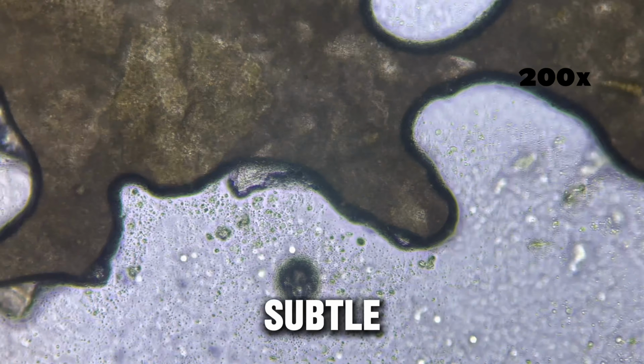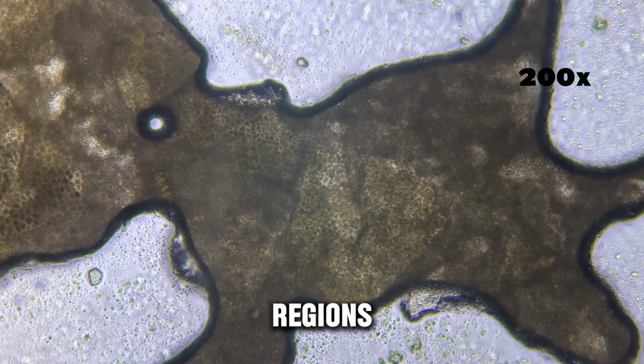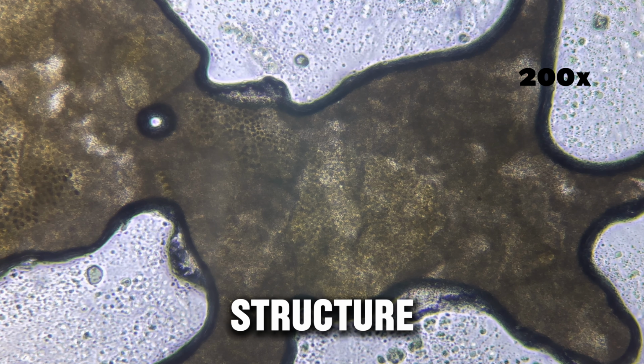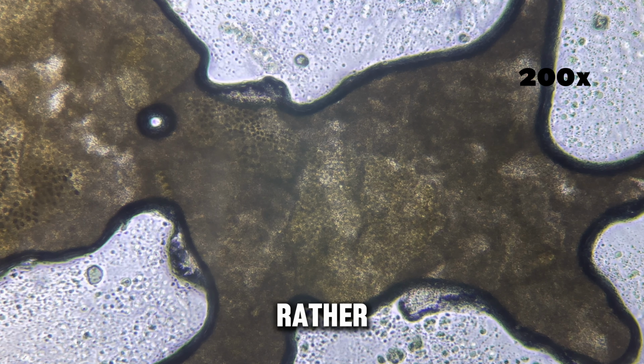Thin borders and subtle lines run between regions. They separate components that did not fully blend at a microscopic level. The structure feels organized rather than random. At this magnification, mustard begins to look like a controlled mixture.